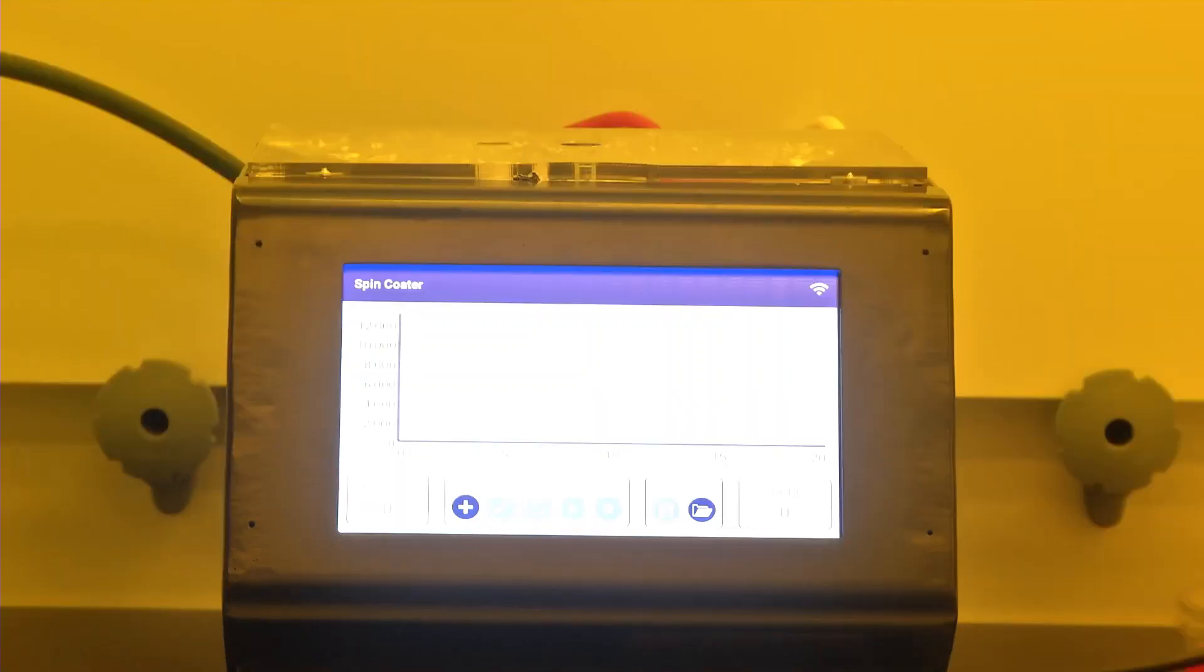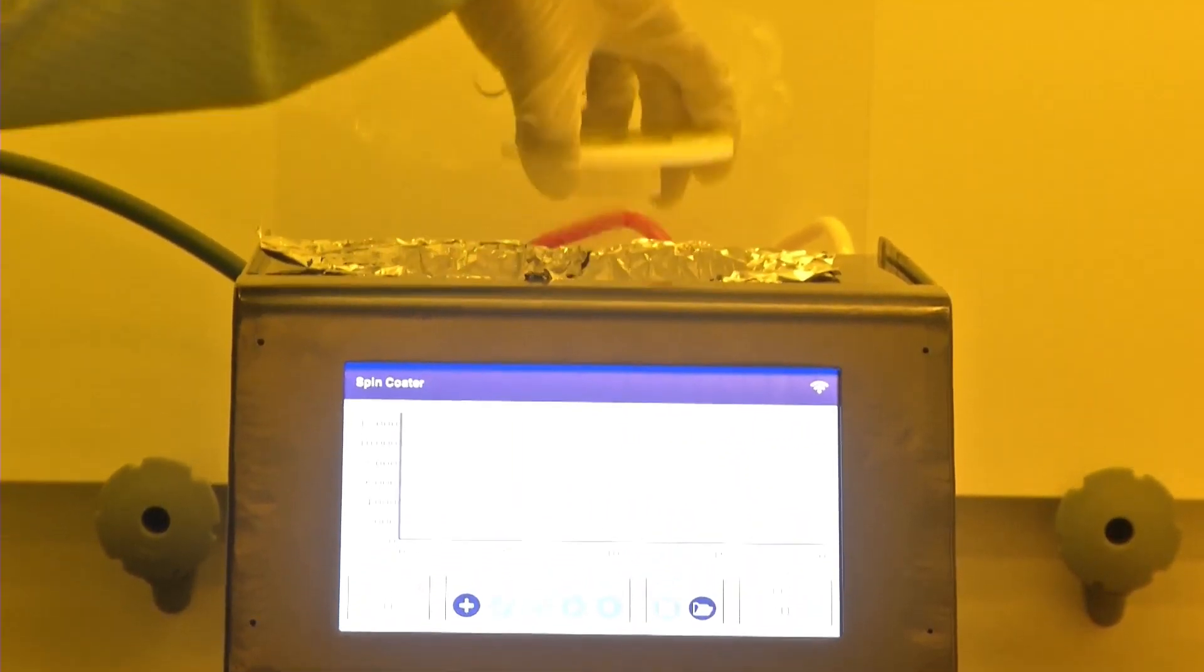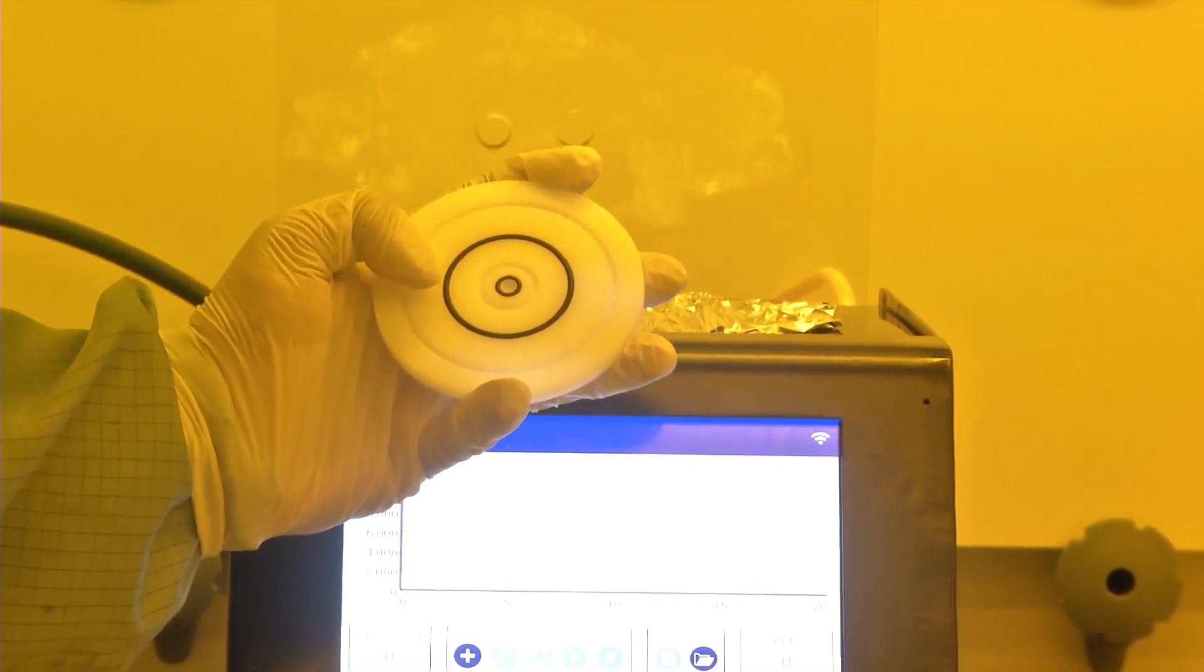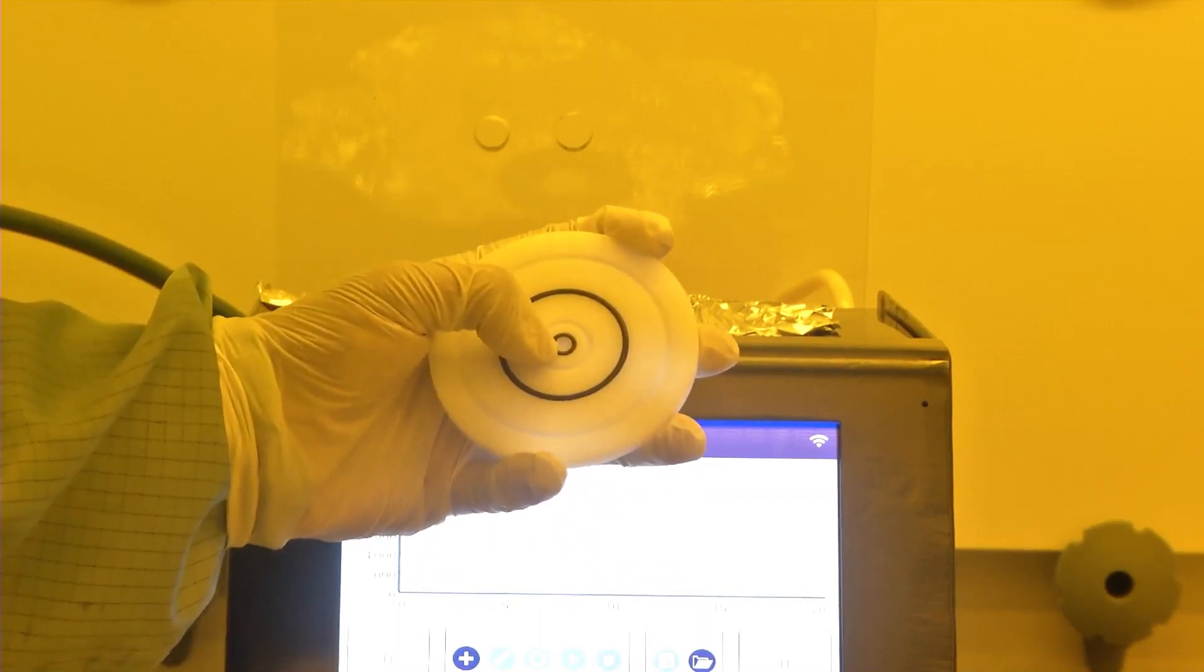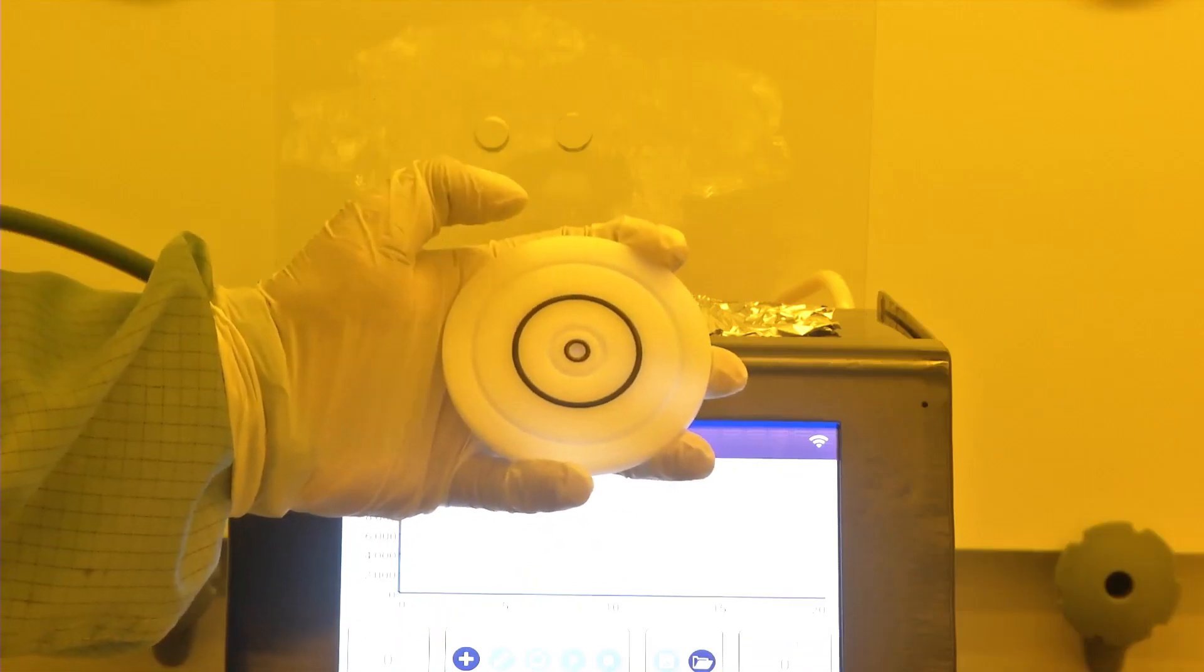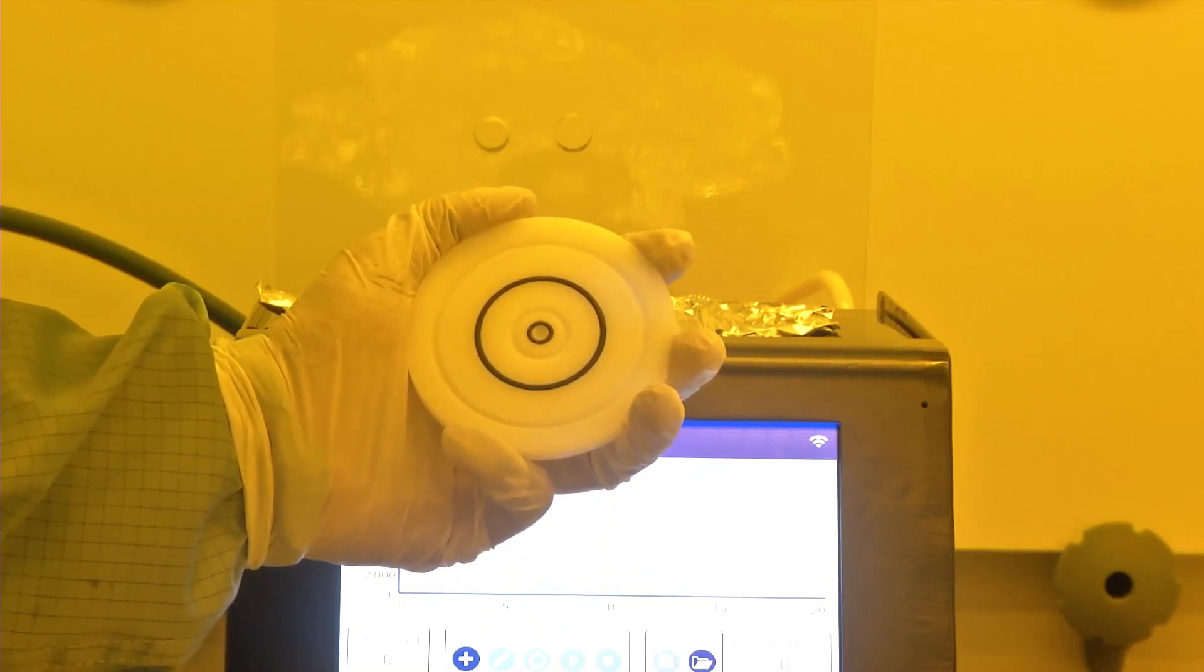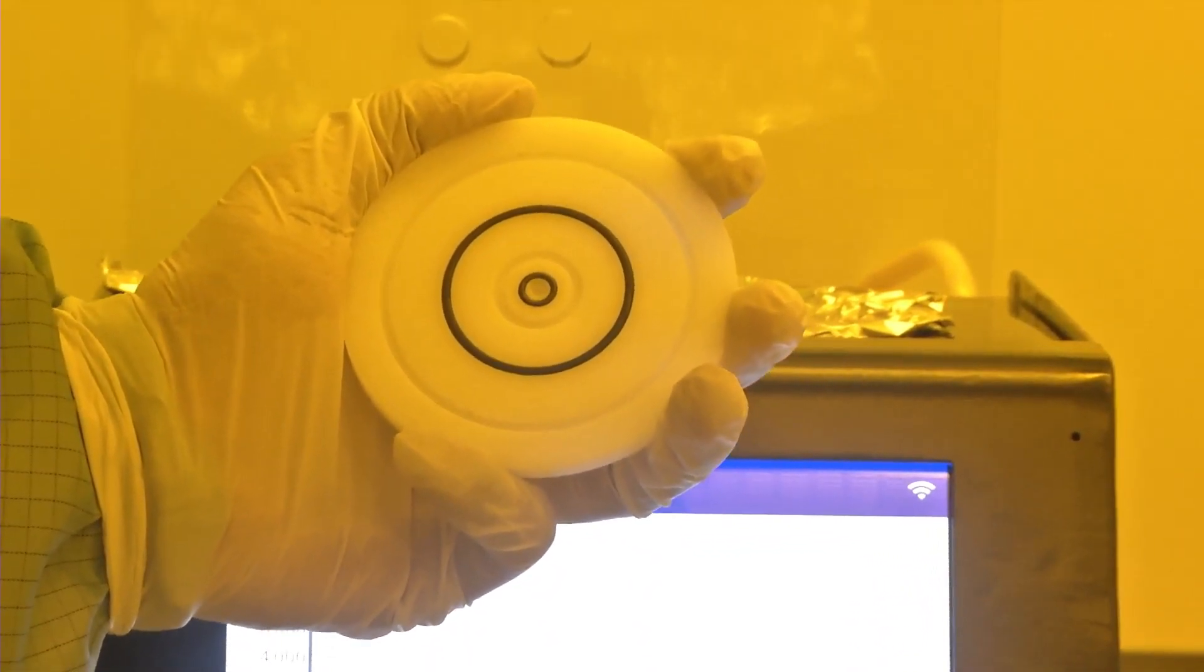We can open the lid of the spin coater and take out the substrate holder. The black color ring that you see is the O-ring. There are multiple grooves depending upon the size of the substrate: the smallest for small wafer pieces, the middle for a 3-inch silicon wafer, the larger for 4-inch silicon wafer. The O-ring should be put after applying vacuum-compatible grease so that the contact between the silicon wafer and the O-ring is leak-free.